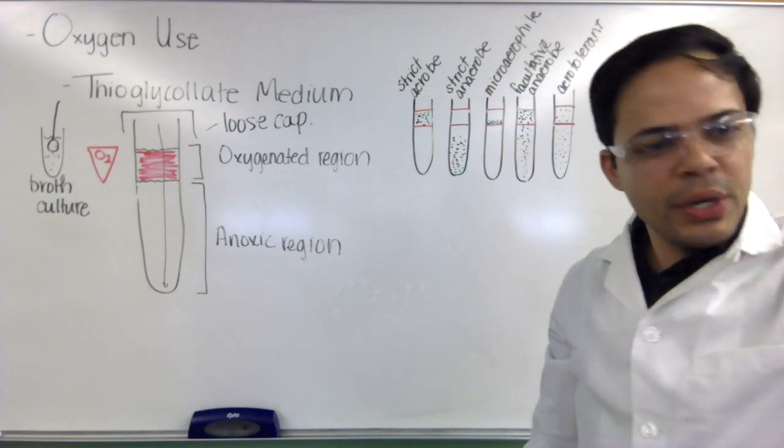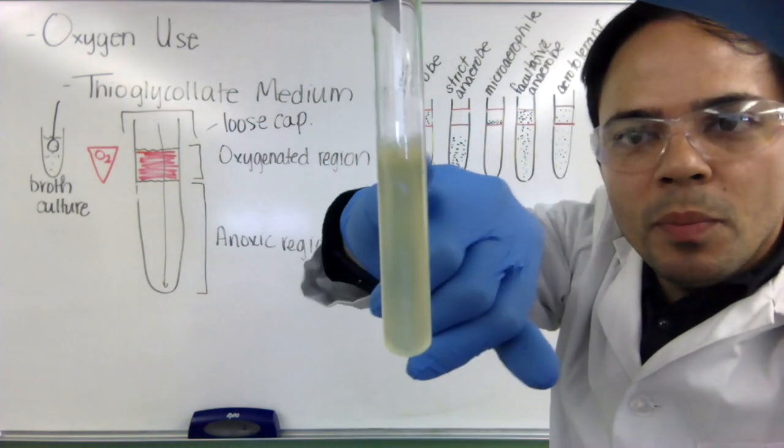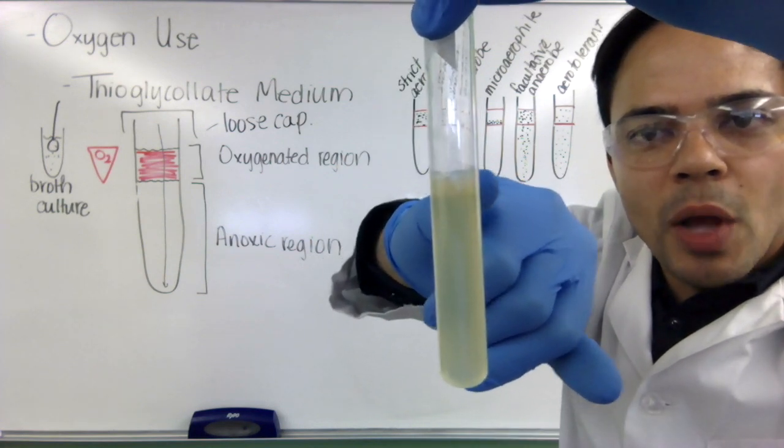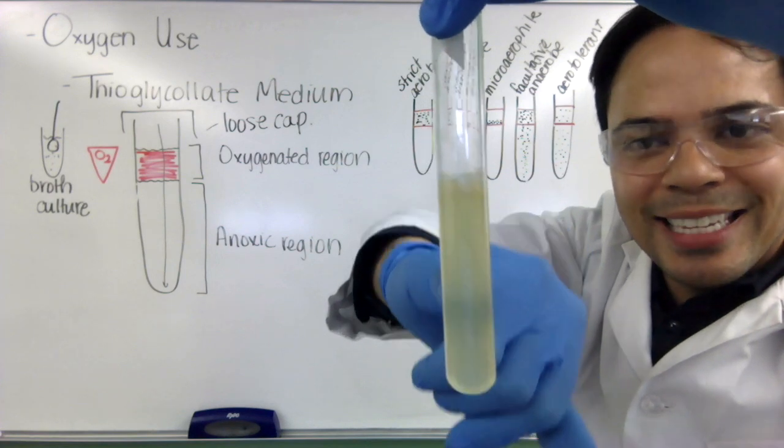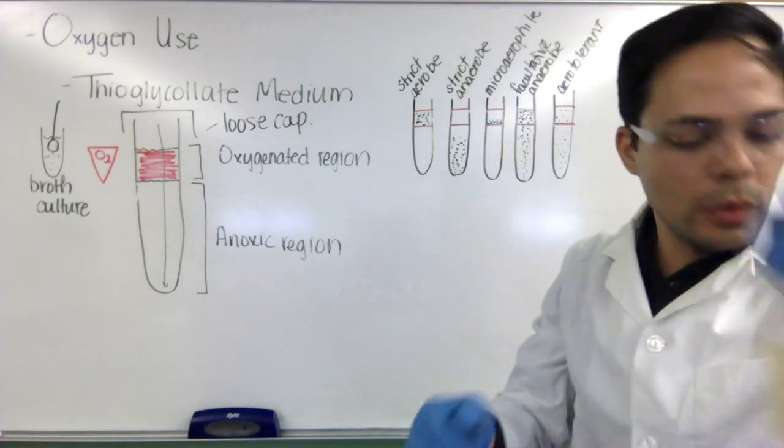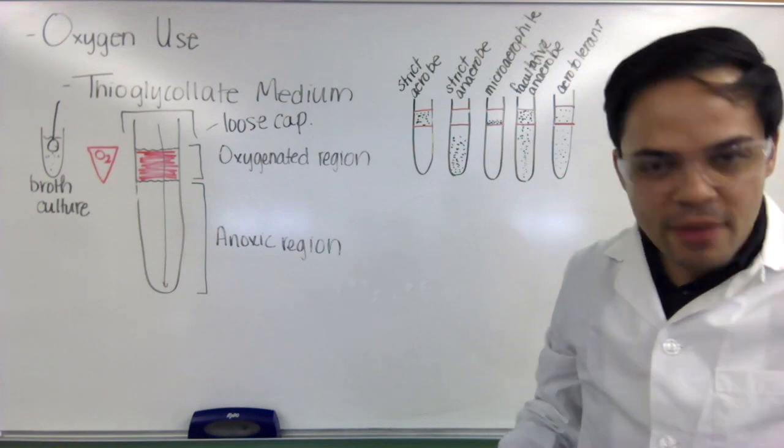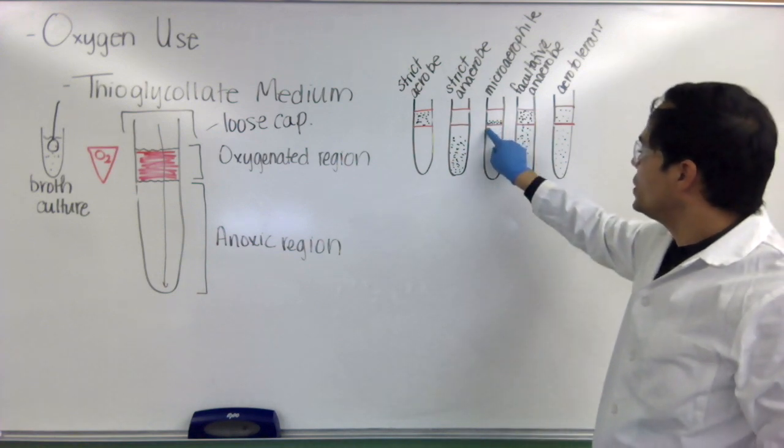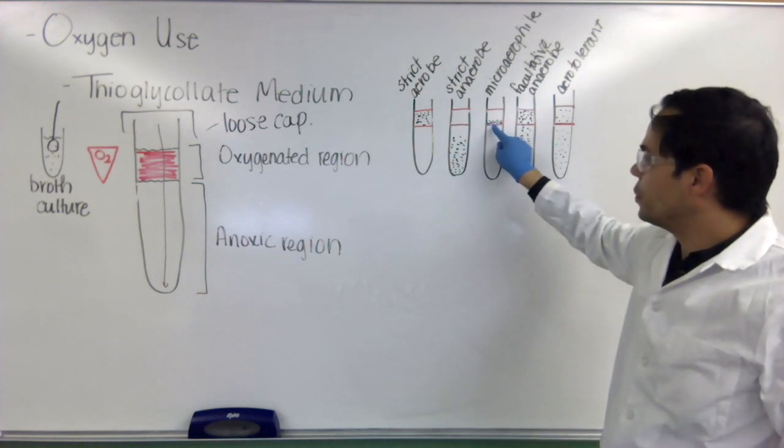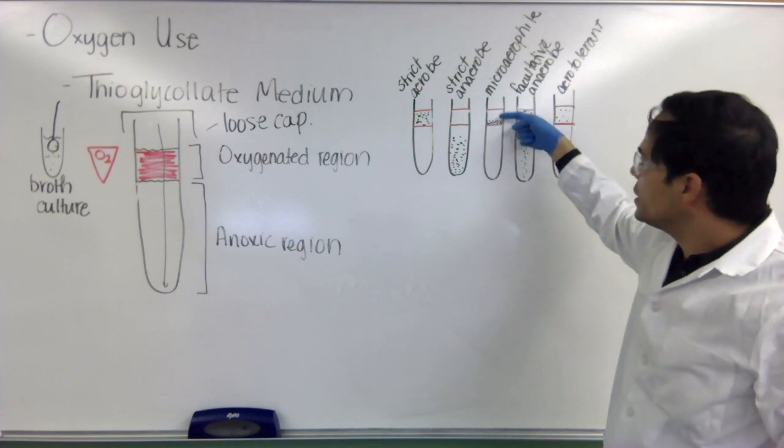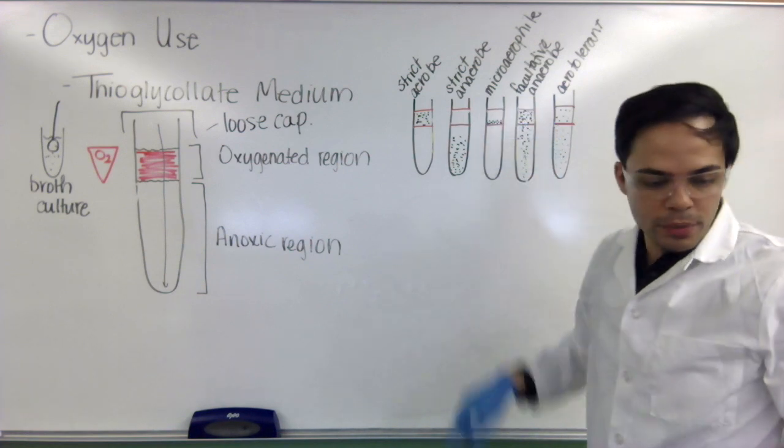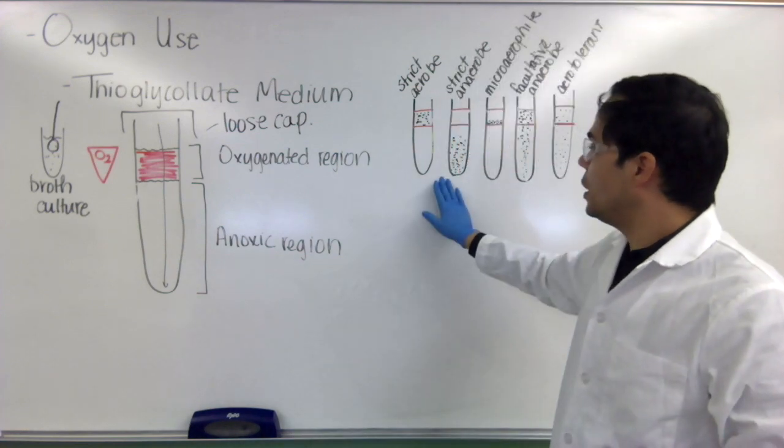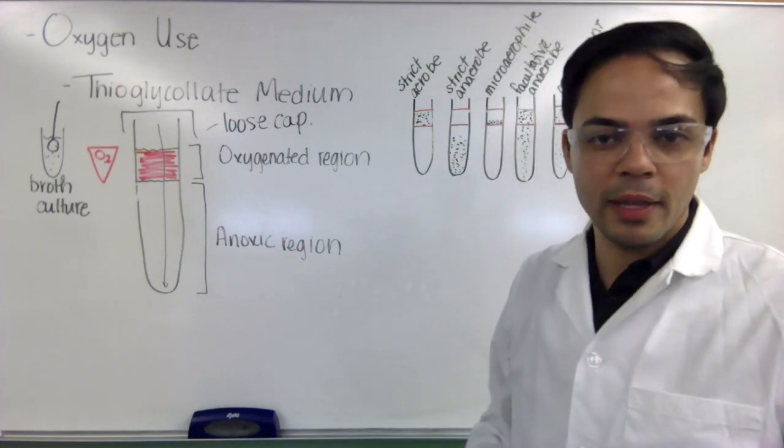This final one here has a pattern of growth that is equal throughout the tube in the oxygenated region and the deoxygenated region. So this one would be aerotolerant. Now, I don't have an example of the microaerophile, but if we did have that one, you would just see a thin band of growth here, right between where you have lots of oxygen and no oxygen. And that's how you inoculate as well as interpret your thioglycolate medium.